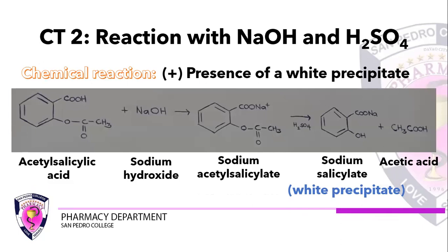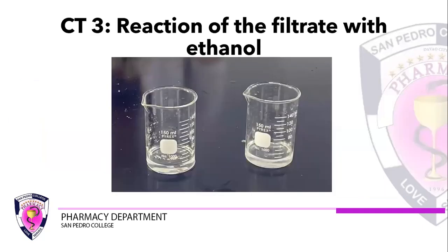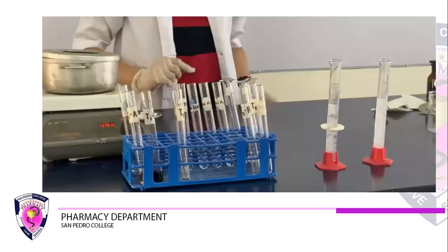So ang dahilan doon, the chemical responsible for the white precipitate that formed was sodium salicylate. Okay, so ano siya? Katong white cloudy precipitate or white precipitate. Cloudy lang siya.